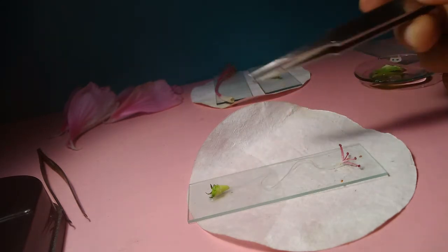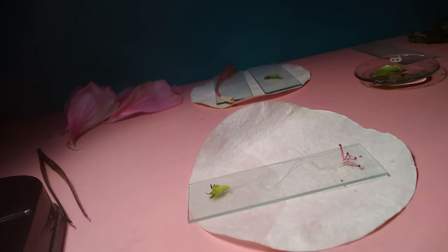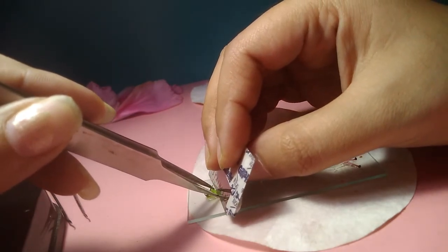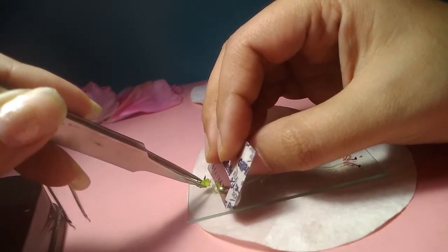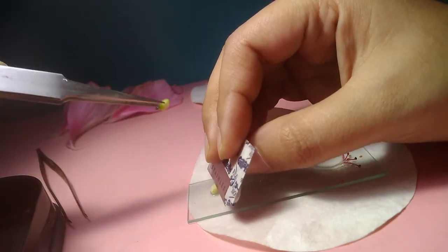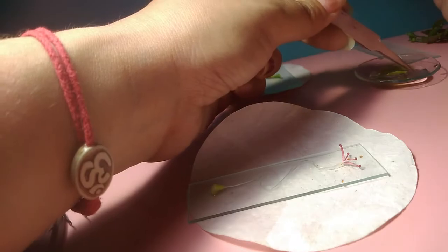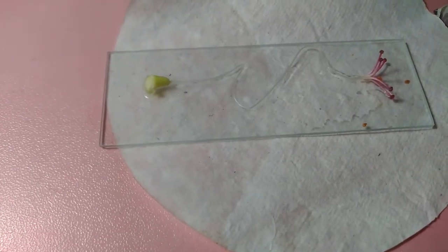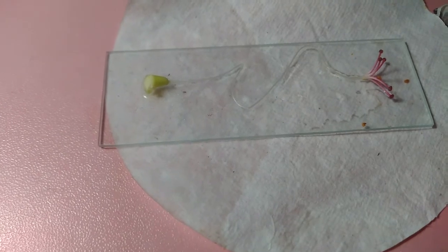Now I will just cut and remove this epicalyx portion. Okay, I think I have removed a little bit. Yeah, it is done, and I will place it in water. And here we have our complete female reproductive structure or our pistil.